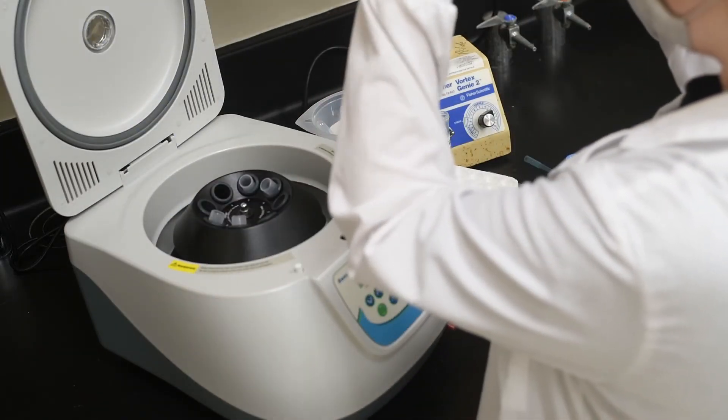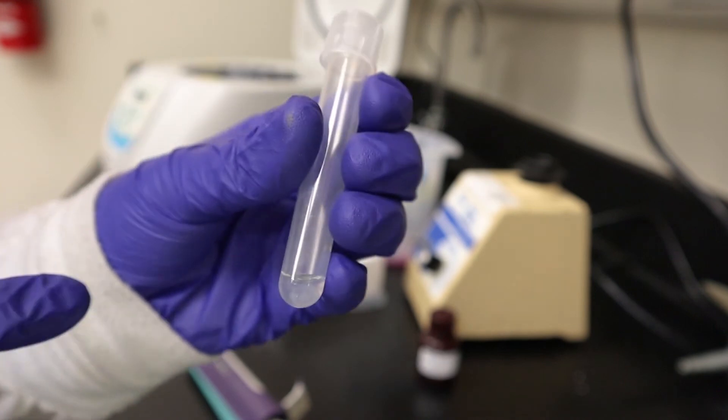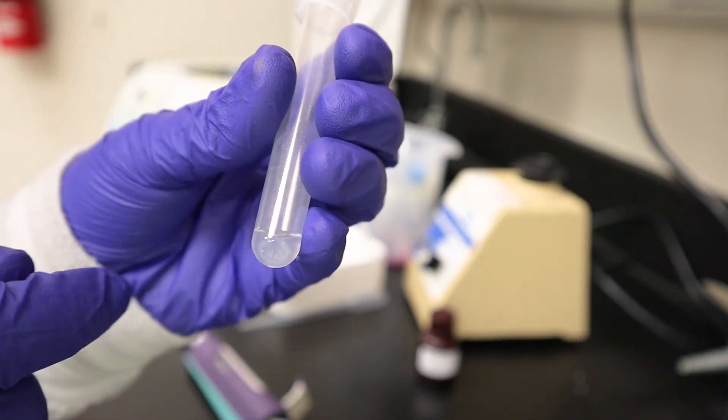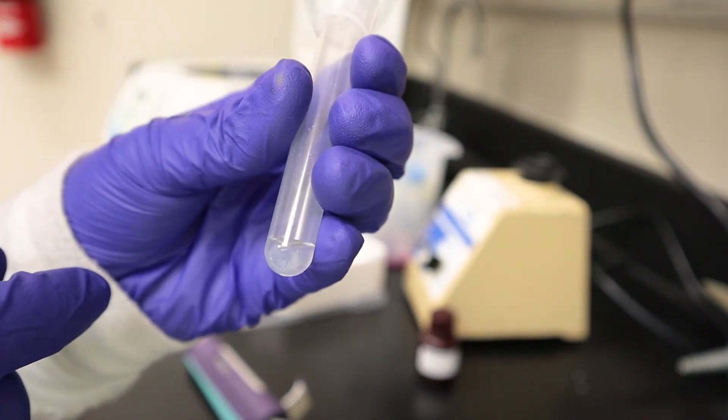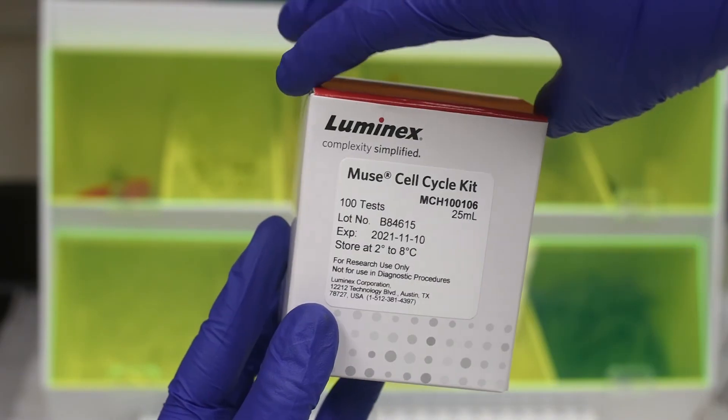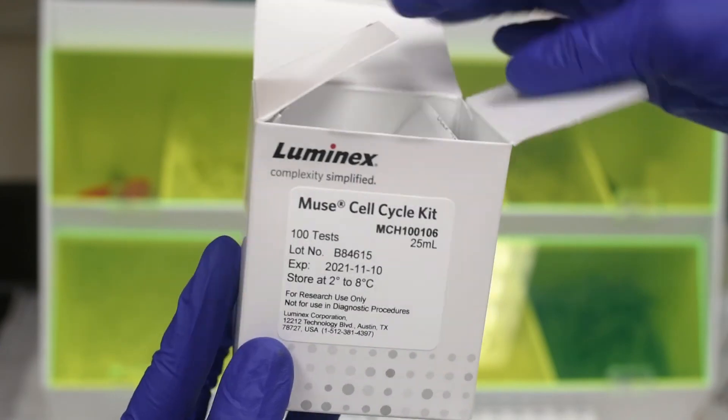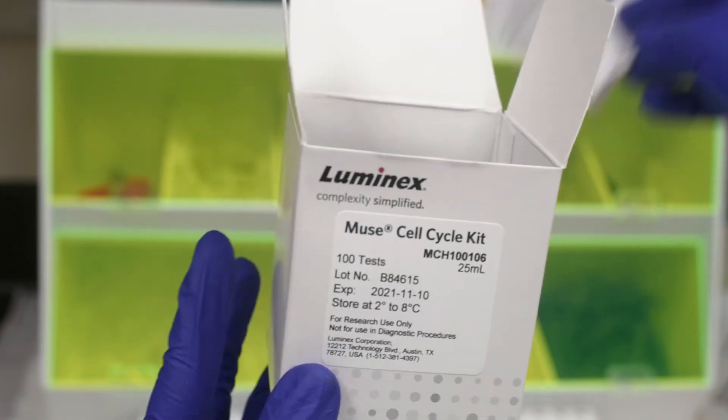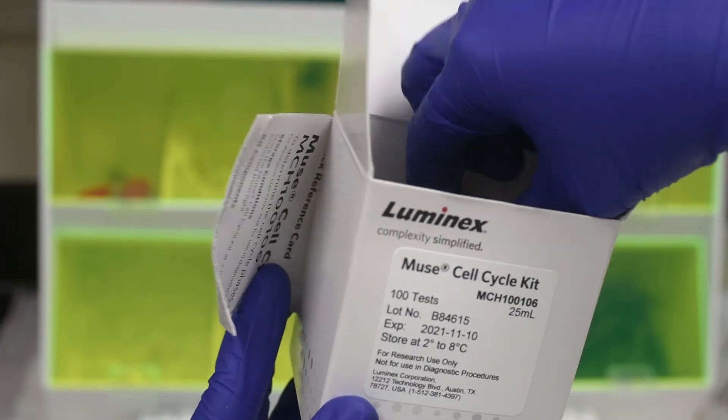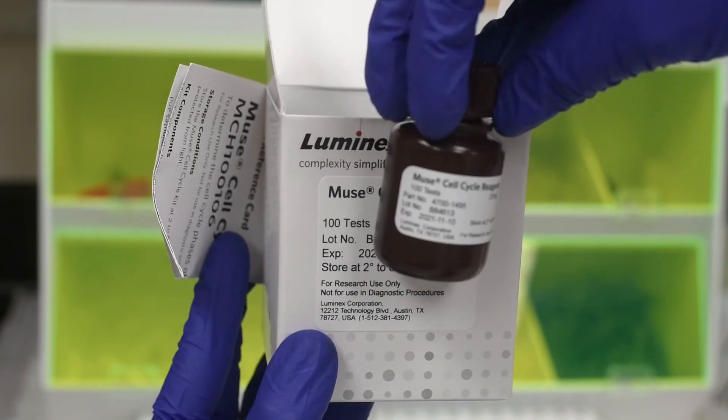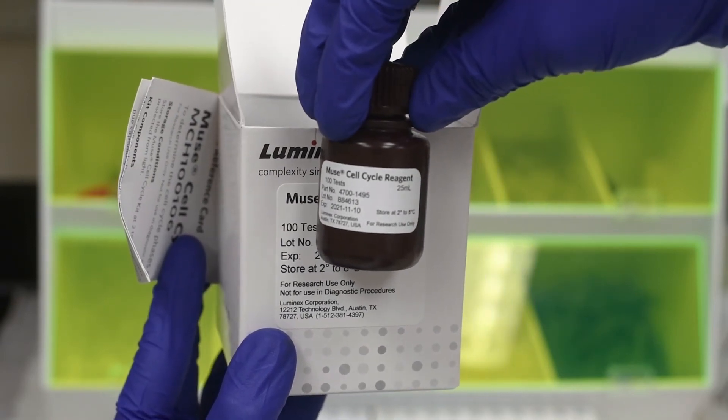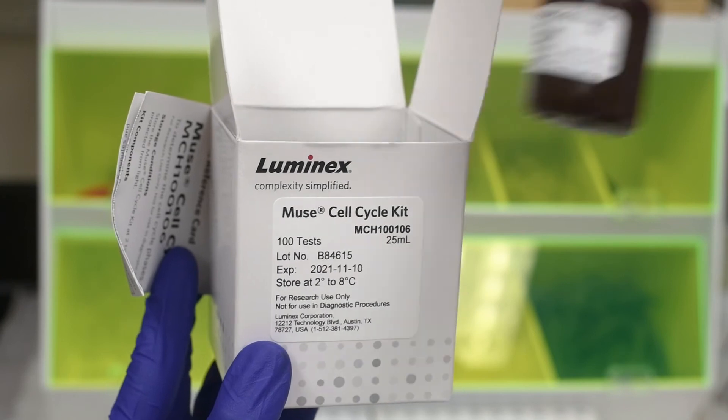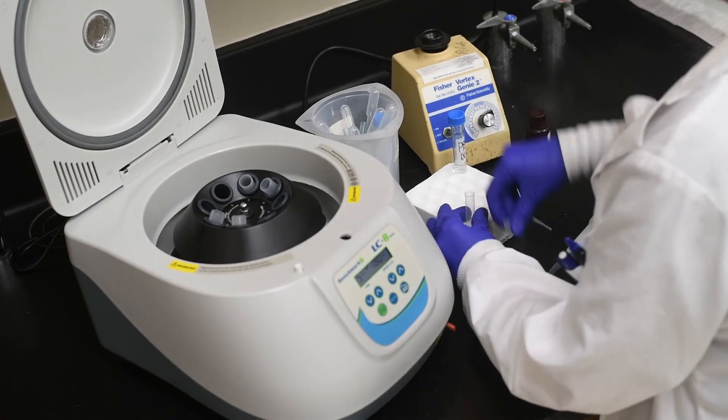Once centrifugation was complete, I carefully removed the supernatant without disturbing the pellet. The reagent used in this experiment contains a proprietary blend of propidium iodide and RNase A that fluoresces chromosomal DNA. The amount of DNA in resting cells differs from those undergoing replication, and the intensity of the stain can be used to determine what phase of the cell cycle each cell is in.